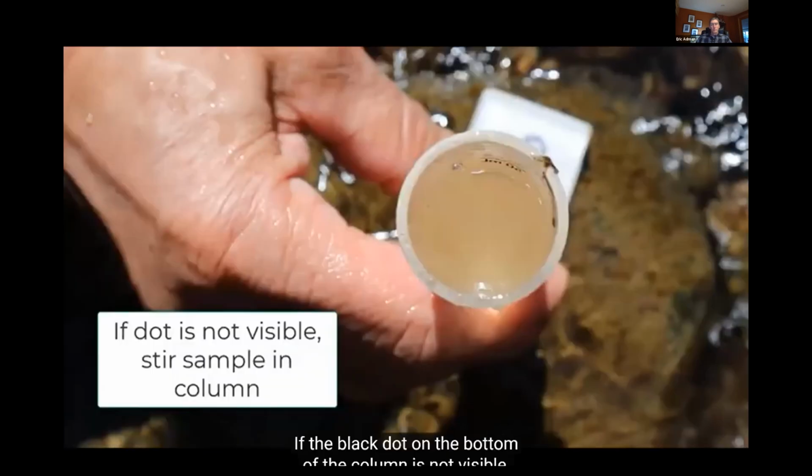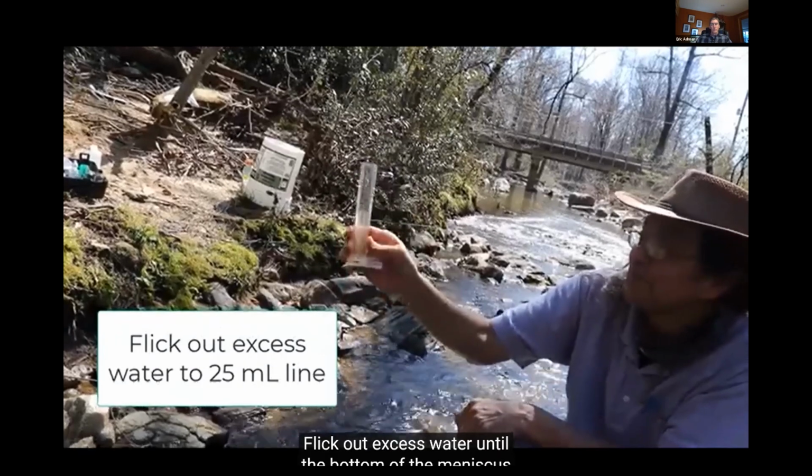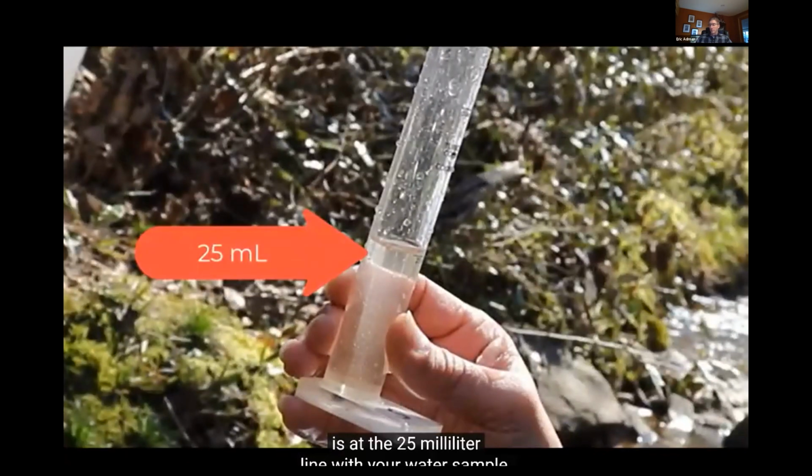If the black dot on the bottom of the column is not visible when looking down through the column, find the clear stirring rod and stir the water sample in the column. Flick out excess water until the bottom of the meniscus is at the 25 milliliter line with your water sample.